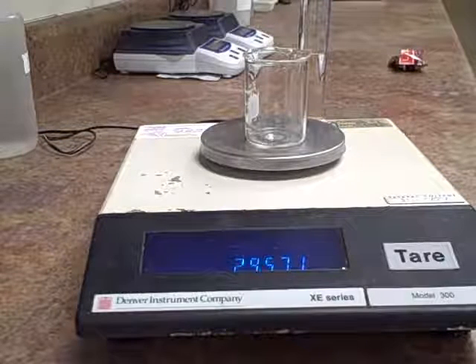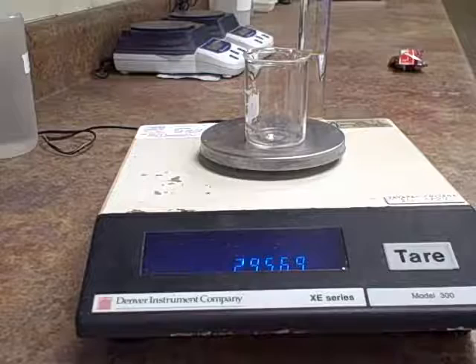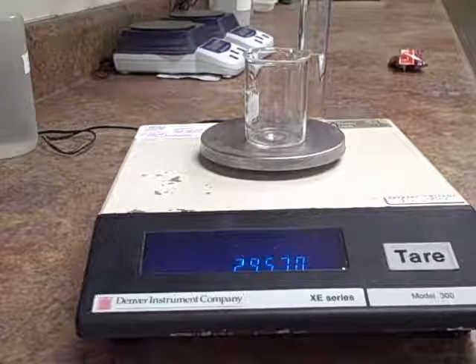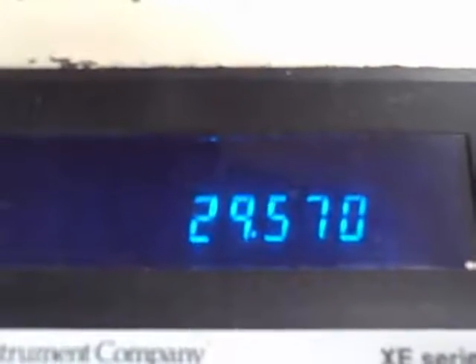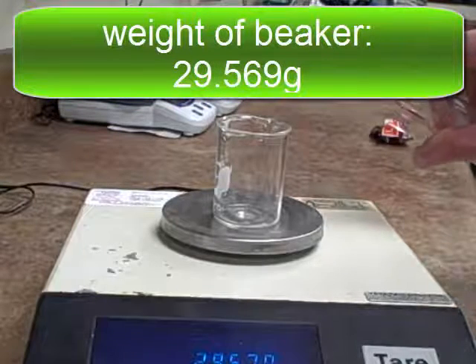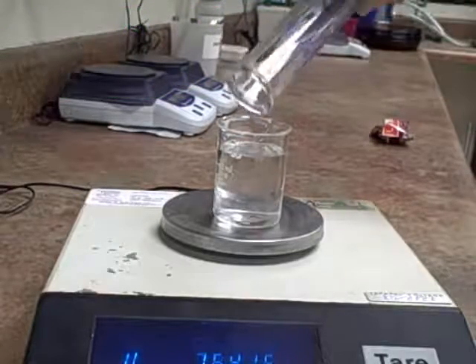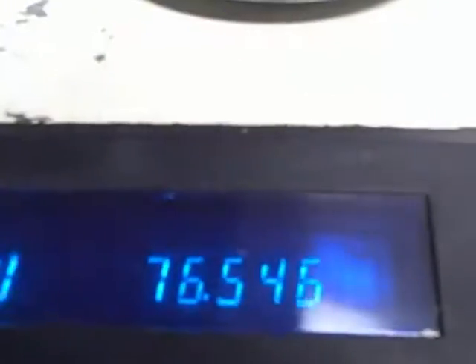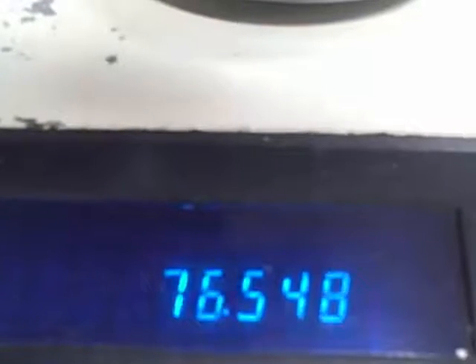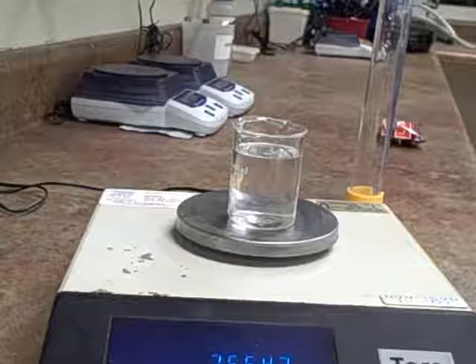But I want to show you a technique where we could just subtract the weight of the beaker, just in case you need to use different balances in a lab and you're not able to get back to the one that you tared. So I want you to record the weight of this beaker. Now I'll add the salt water, and record the weight of the salt water and the beaker. Now you have the data you need to determine the density of the salt water.